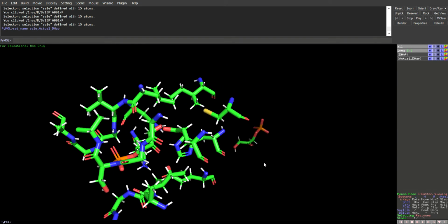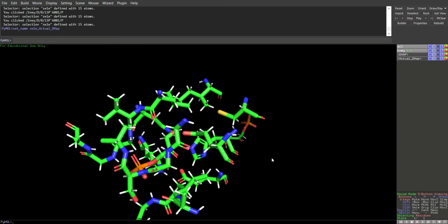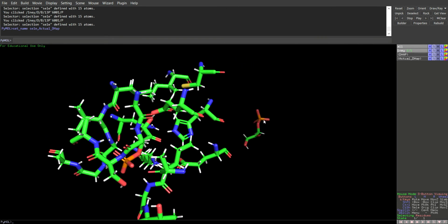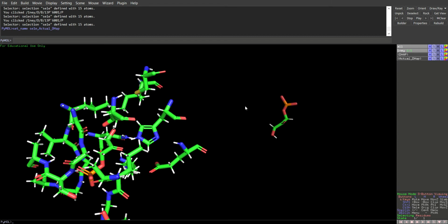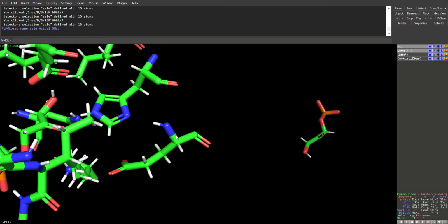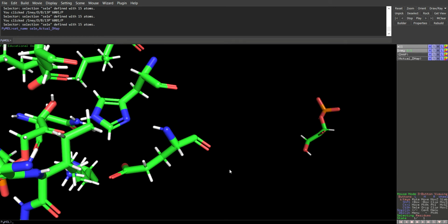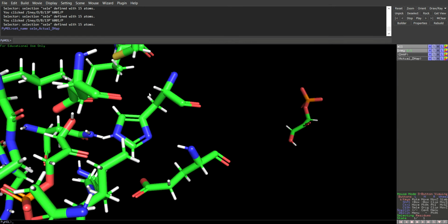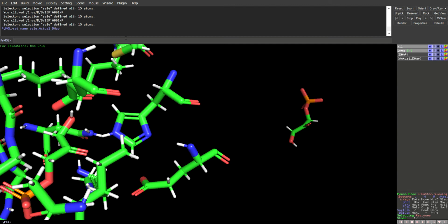You want to measure the distances between two things. So to do that, I'm just gonna pick random ones, but let's pick here. Let's pick this one and this one. This one's glutamic 97. This one is histidine 95. You will need them. I'm just gonna do them now. And what I want to do is measure the distance between whatever they are.